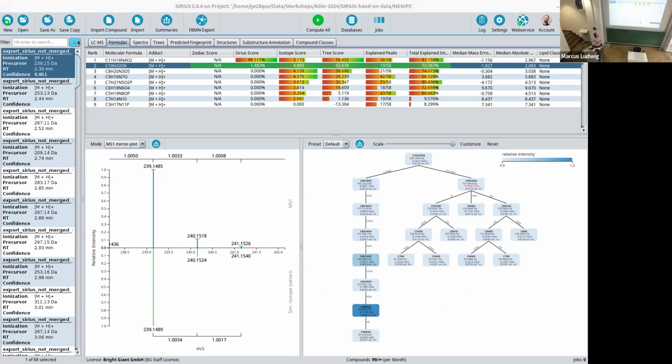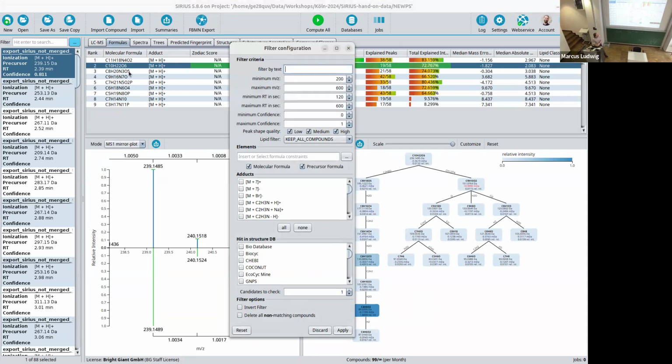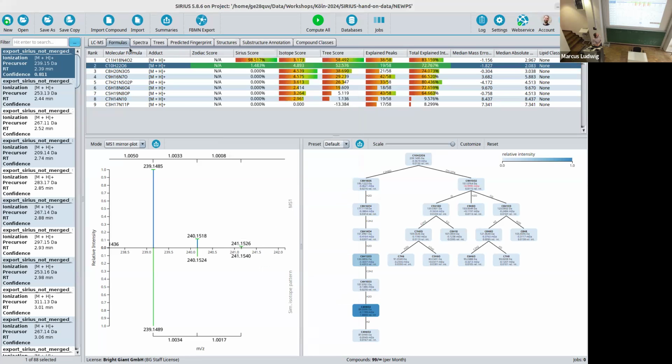Yeah, so you have it also in yours. This is the one that is in the slides basically, so that we don't have to. I mean, you don't have to have the exact same filter in here. It's not so important for the hands-on, but in the slides, I think I use these parameters here, and it gives you an idea.